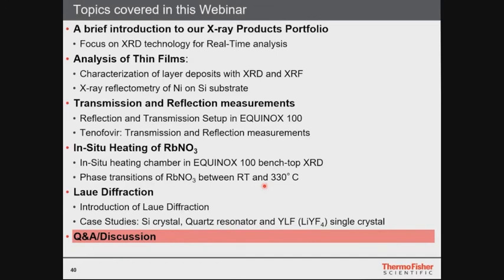And so it's also very important to see that when we emphasize so much on the benchtop instruments that Simon presented today, it is also to make them economically viable for the majority of laboratories alongside an FTIR or a Raman or a small benchtop EDXRF type instrument. So that's also very important: there is no single technique that gives the absolute truth. It's always a combination of multiple techniques that makes material characterization complete.